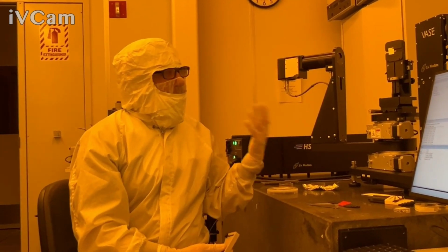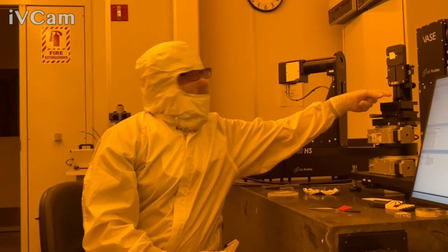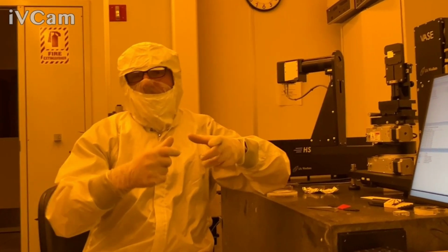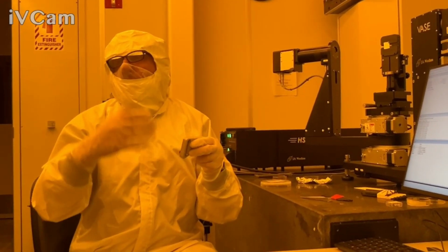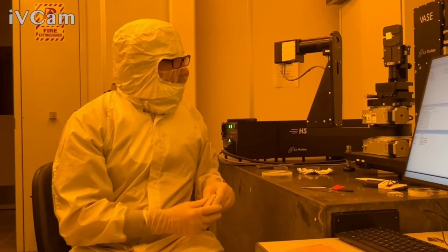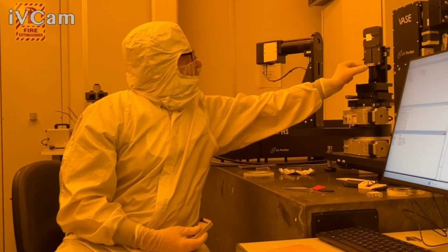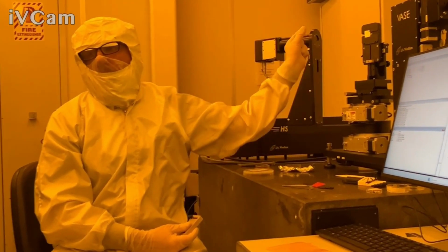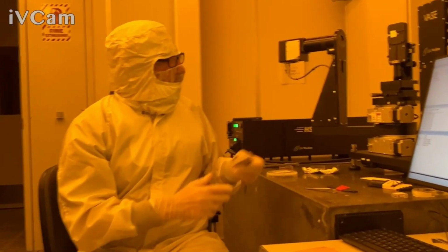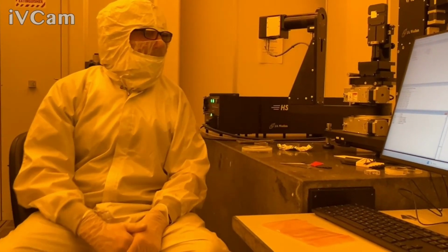In our lab, if you have a precious sample, because we do things overnight, sometimes we add a little catcher in case the sample falls. Very rarely does it happen, but it can happen if you lose power. Similarly, this can only go up to here, but if you're always mounting a certain wafer size, you can slide that up and it becomes a little shelf. So mainly it's the sample falling. If you have an incident, let us know.